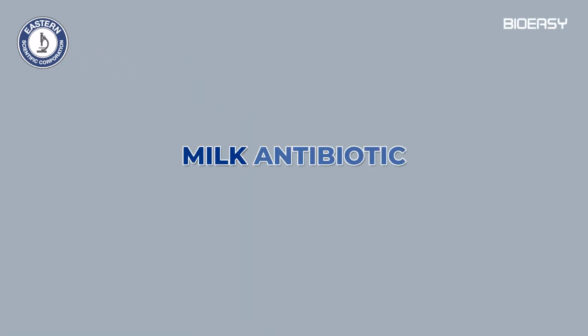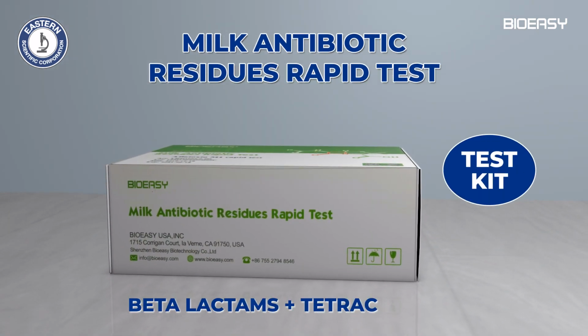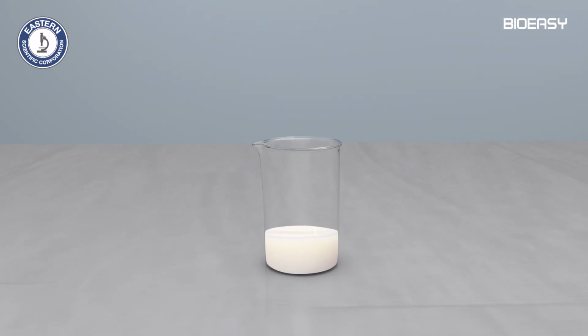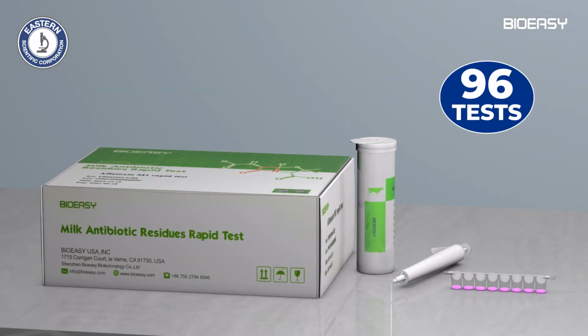Milk antibiotic residues rapid test. This rapid test is used for detection of beta-lactams and tetracyclines in milk. It takes about 8 minutes. The milk may be raw, pasteurized or full cream milk powder. 96 tests can be conducted using this kit.